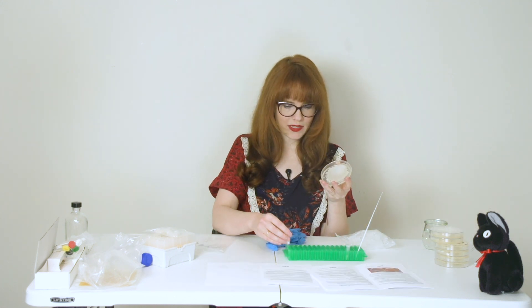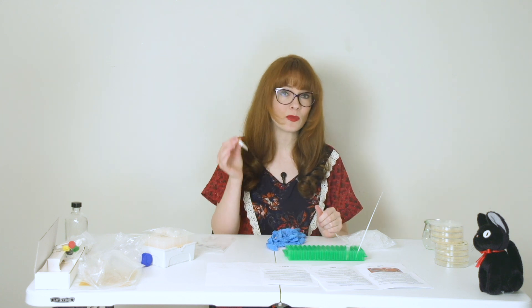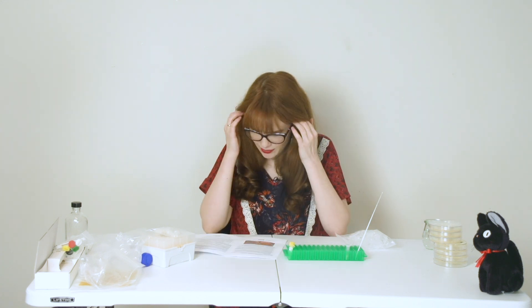We're going to take our newly grown yeast and mix it with this transformation mix that weakens the cell's wall so that new information can be injected.